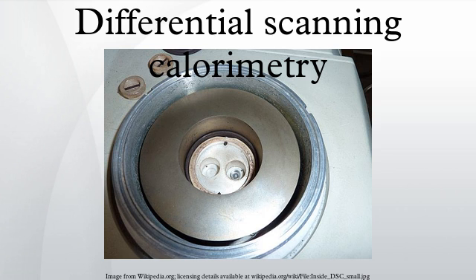It can be shown that the enthalpy of transition can be expressed using the following equation, where the enthalpy of transition is the calorimetric constant, and is the area under the curve. The calorimetric constant will vary from instrument to instrument, and can be determined by analyzing a well-characterized sample with known enthalpies of transition.